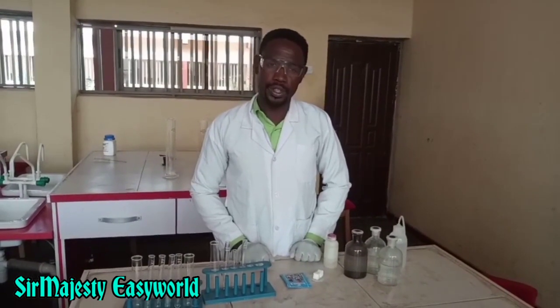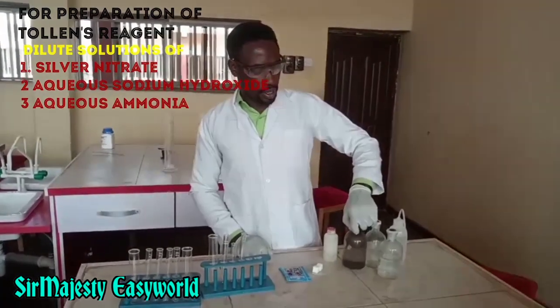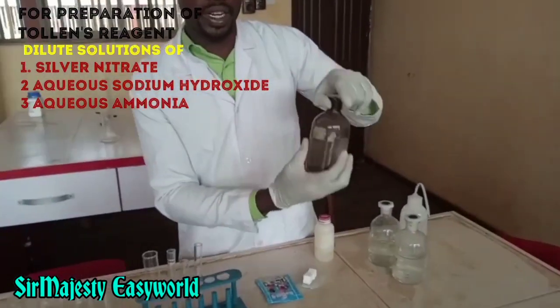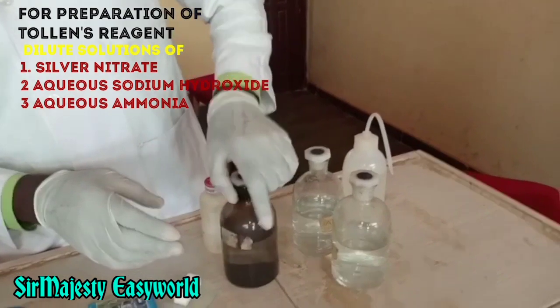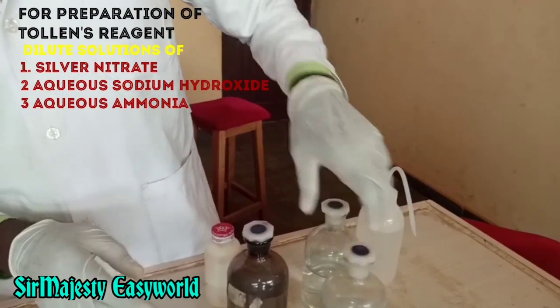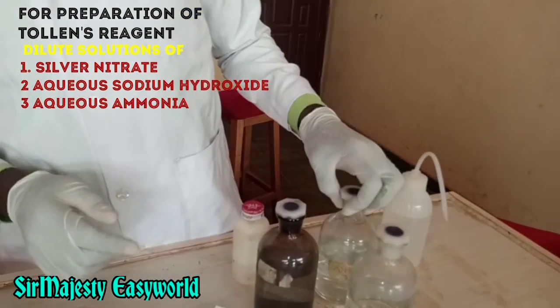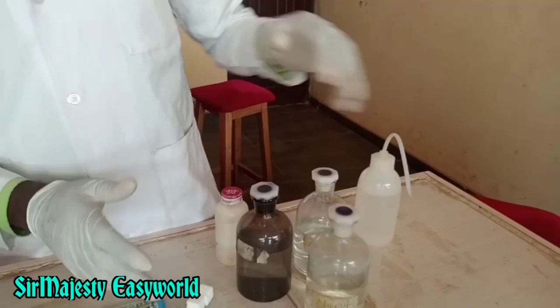The reagents required: we'll be using Tollens' reagent, and we'll need these three things in the making of it. We have the silver nitrate here, and we have the sodium hydroxide solution. Then we have the aqueous ammonia for making of the Tollens' reagent.